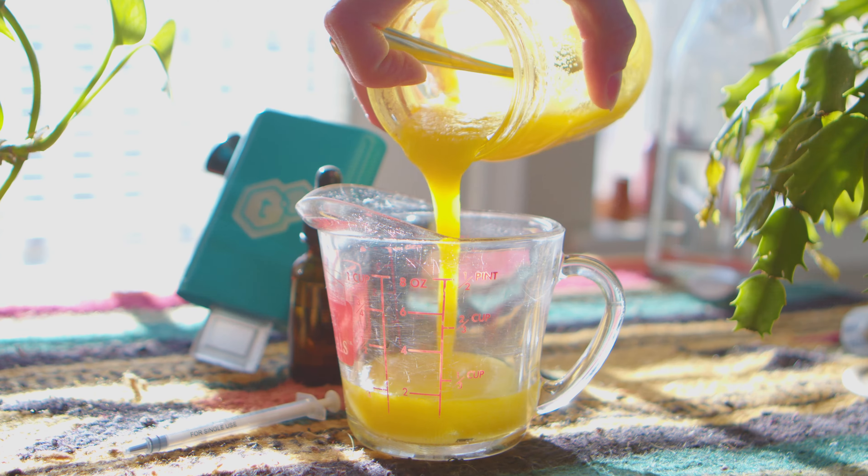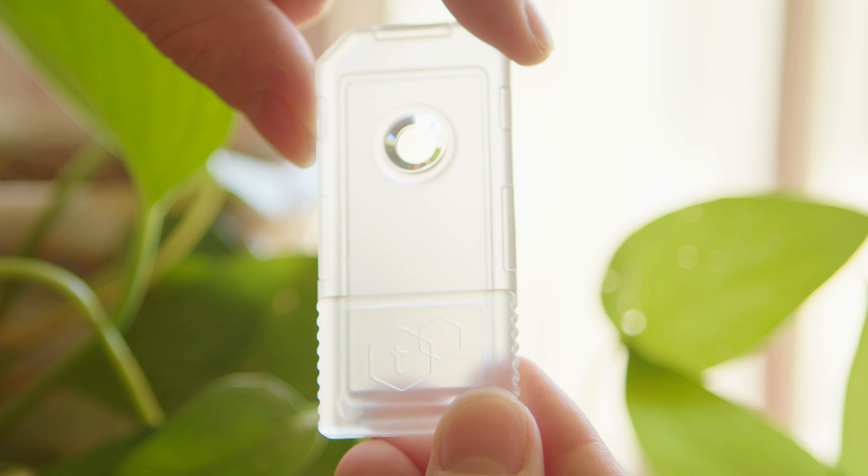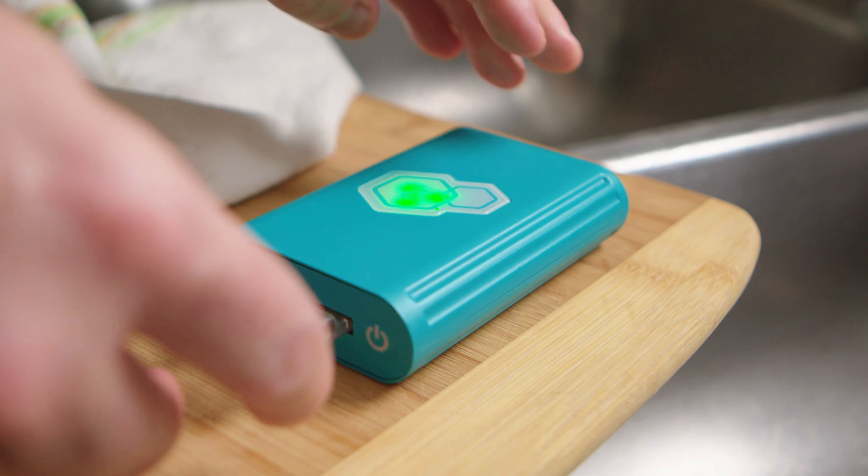Make an infusion with your preferred strain and cooking base or tincture. When the infusion is ready, put a couple drops in the T-Check testing tray. Open the T-Check app and select the test you want to run. Insert the tray into the T-Check device.